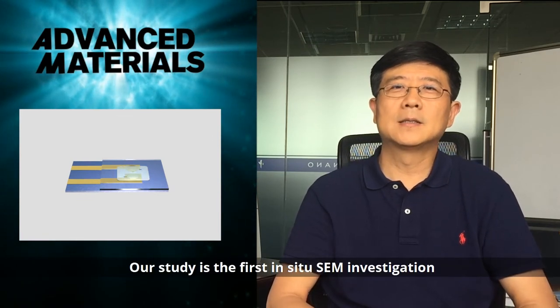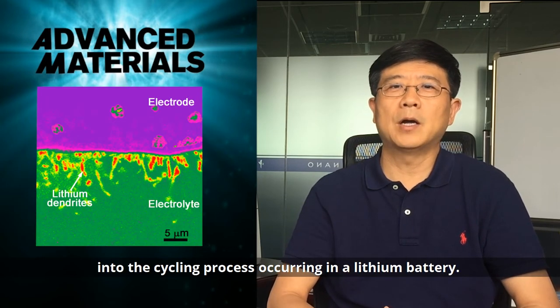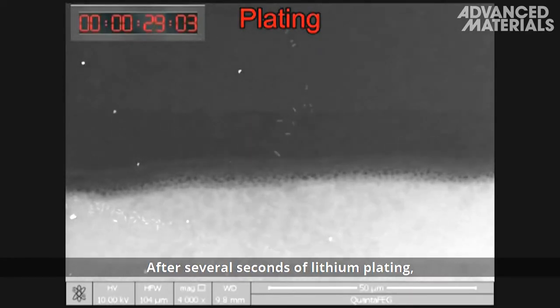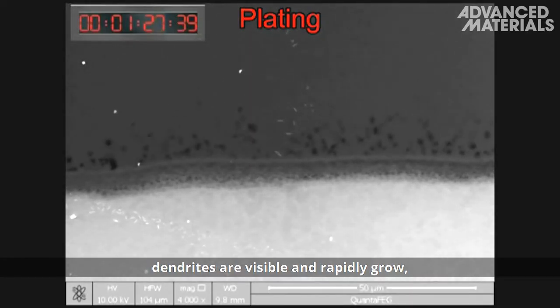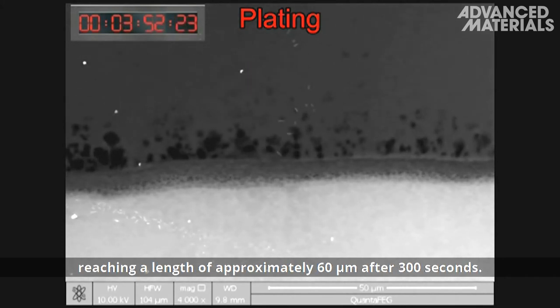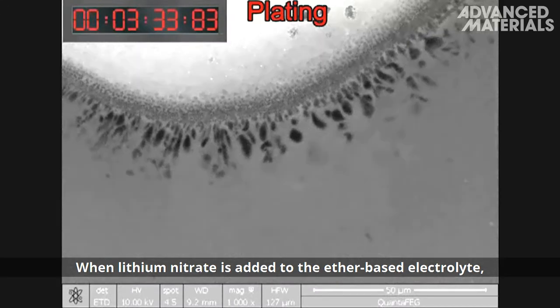Their study is the first SEM investigation into the cycling process occurring in a lithium battery. After several seconds of lithium plating, dendrites are visible and rapidly grow, reaching a length of approximately 60 micrometers after 300 seconds.